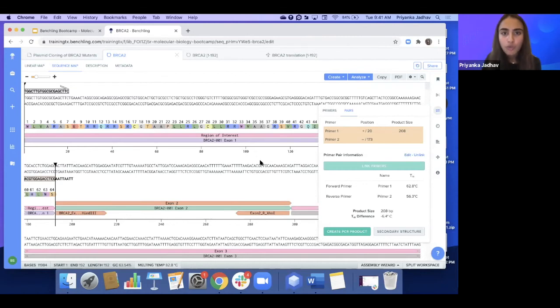So our question for everybody is, how do you currently reference a DNA or amino acid sequence within your notes? So the first option is copy and paste the sequence as text. The second option is copy and paste the URL link to the sequence. The third option is download the sequence file and attach that to your notes. Fourth is @Benchling a Benchling sequence, and fifth is other.